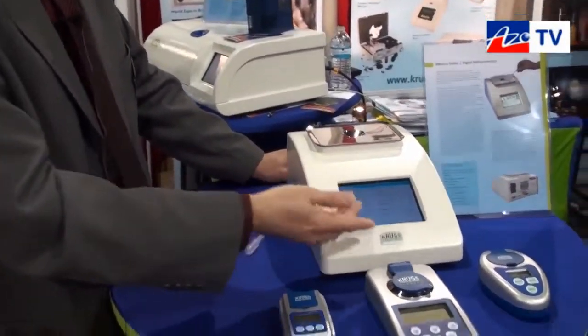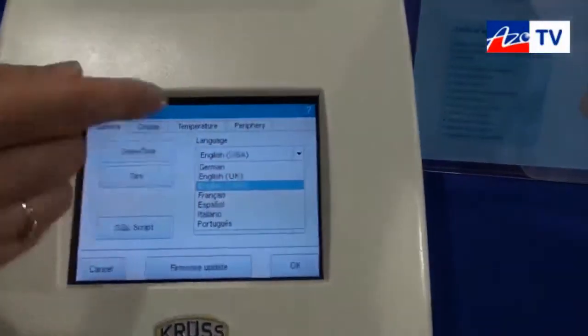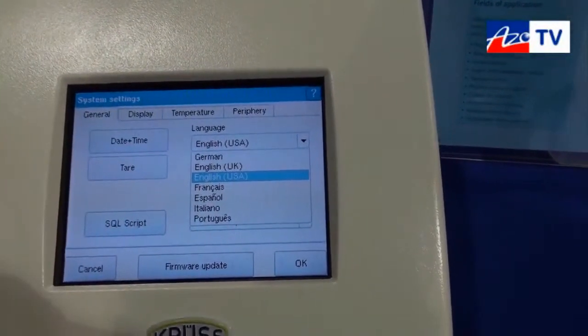In the system, we have settings for language and date. We have different languages available: English, German, French, Spanish, Italian, and Portuguese.